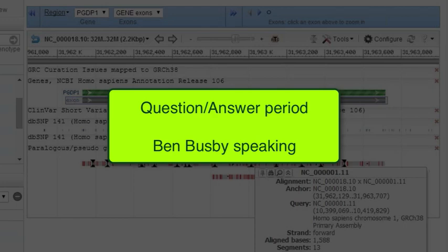So that is what a variant call is, and there are a lot of caveats to how we do variant calls, and how the community in general does variant calls. There were some specific questions on this, and we're probably going to try to get to those individually. Some of those questions were very complex, but we'll try to put those in a public forum as well.